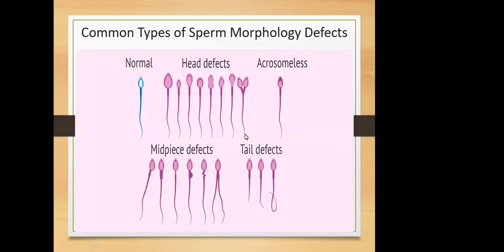All right. So these are all some common pictures, and I'm sure that with what you have done, if you look at the pictures, you'll be able to know which one is which.